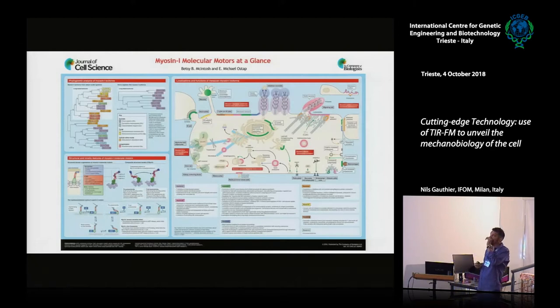And there was very little clarity in this system, meaning imaging is poor, it's mostly done with some sort of assumption with knockdown and so on. When stuff is perturbed, you can say many things because there may be some chain of events that leads to the perturbation. It's not directly the myosin doing the job. Then we use the macrophage because there was one evidence in '95 that maybe myosin 1G was implicated. There was an immunofluorescence, basically. All this little guy here is one immunofluorescence, actually.